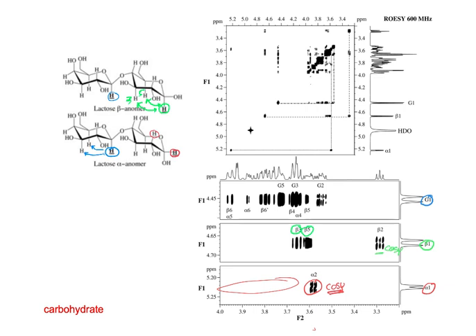I think the amount of NOE would be proportional to the population, or how much time it spends in which state. Right, so if you did have some group that was rotating and you had two protons on each side, it might see some NOE to one side and some to the other side.